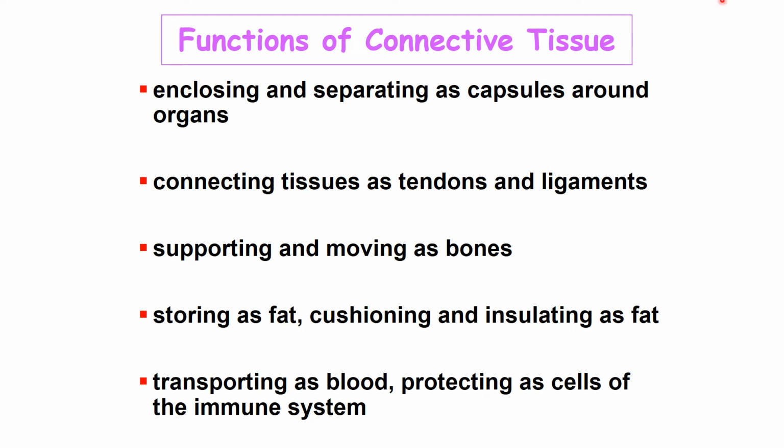Our next slides are going to be of connective tissue. Connective tissue is kind of interesting because we think of it as connecting things, but sometimes it's hard to imagine how it's truly connecting. Connective tissue has cells, and we'll see the cells in each example, but it also has a matrix, and a matrix is a substance that's outside the cell. What that is composed of depends on the particular type of connective tissue.